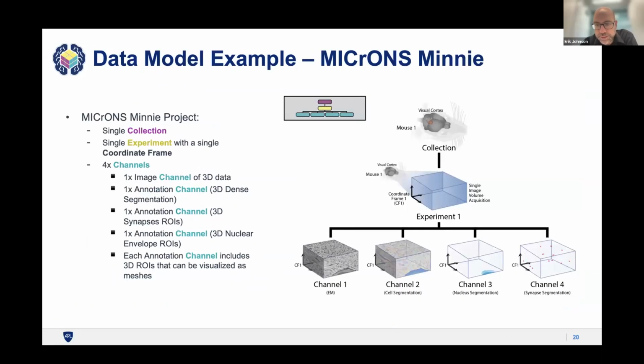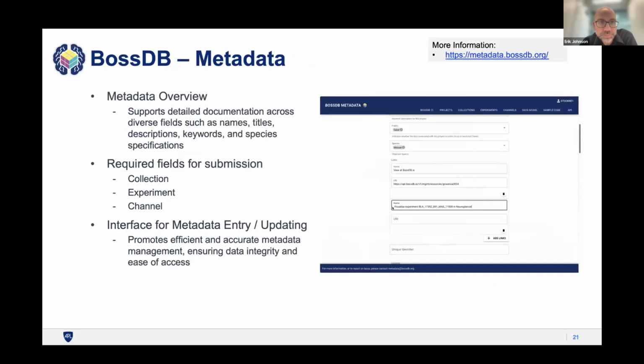And so this is pulled together, like I mentioned, into a single experiment with all of these different sub-channels to organize the different subsets of data. And so large single volumes are also very well suited for BossDB.